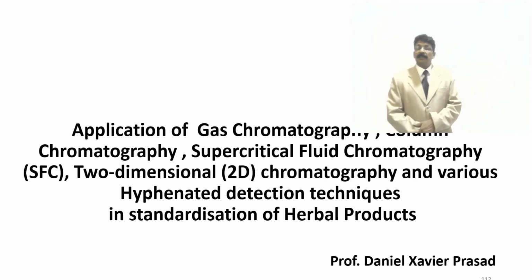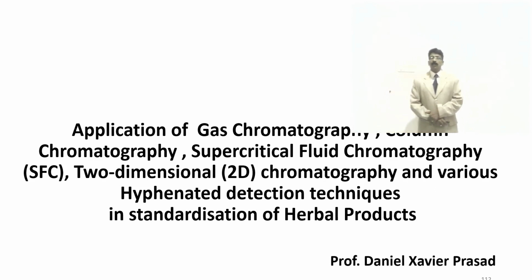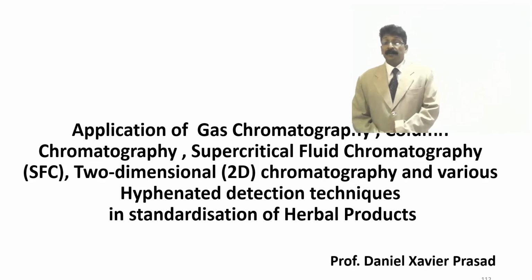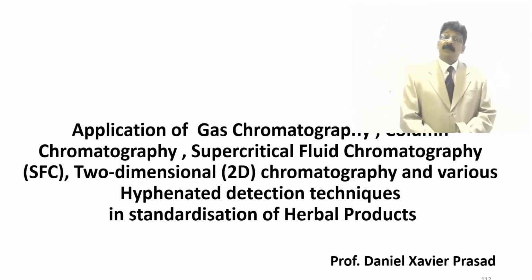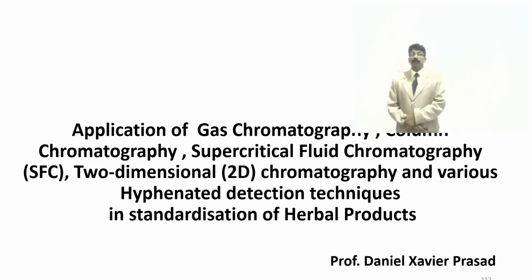In that case, you should be able to write about GC-MS or LC-NMR. Even IR spectroscopy is connected with liquid chromatography and gas chromatography.